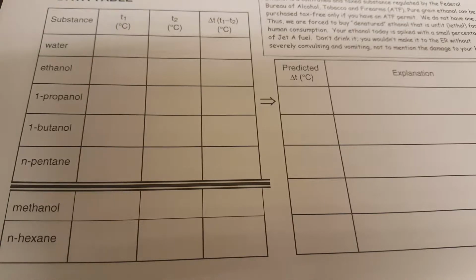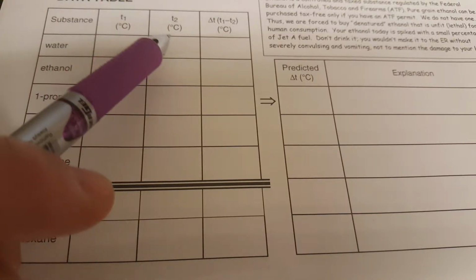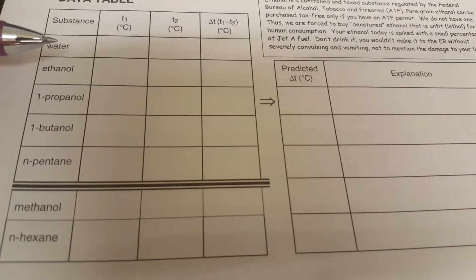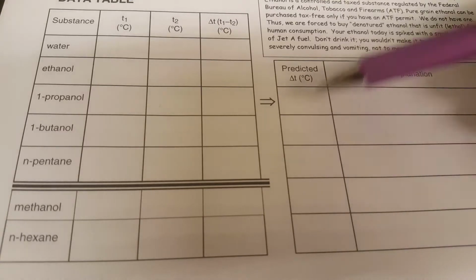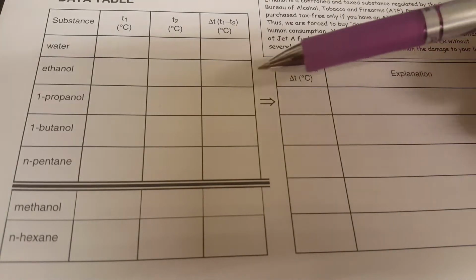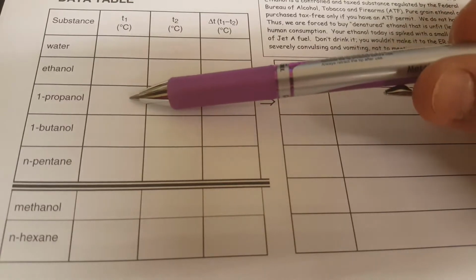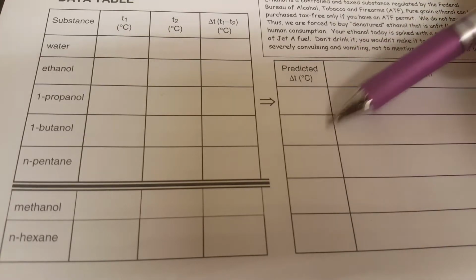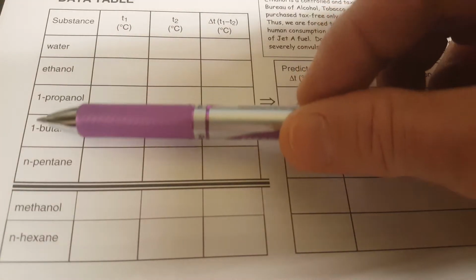The most important thing about this data table is that here's your initial temperature, here's your final temperature, here's your change in temperature. Now that's all easy, but after you do the water and the ethanol, I don't want you to jump to the propanol. In fact, I don't have 1-propanol, I have isopropanol, which is fine. It should be similar. And so come over to this side and make all of your predictions, and then explain your predictions while your partner is setting up the 1-propanol. You guys talk about it and you do this. I want this filled before you do the 1-propanol.